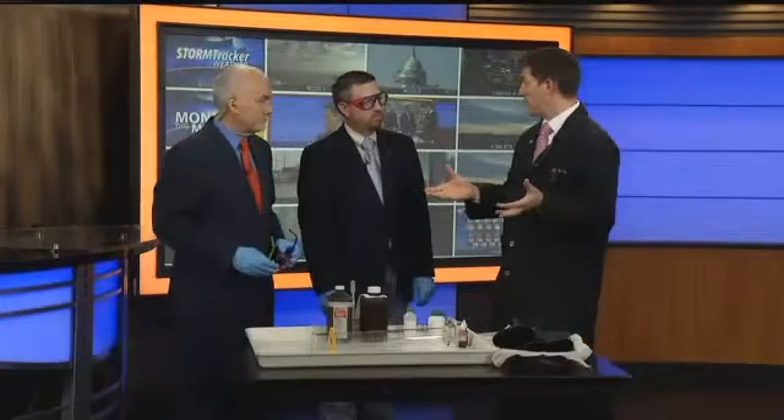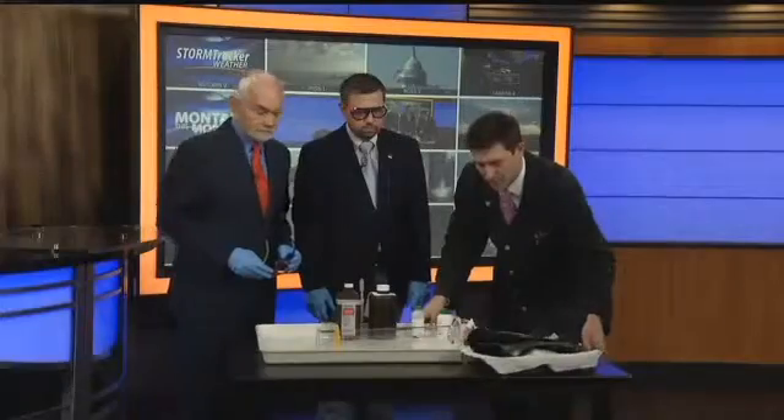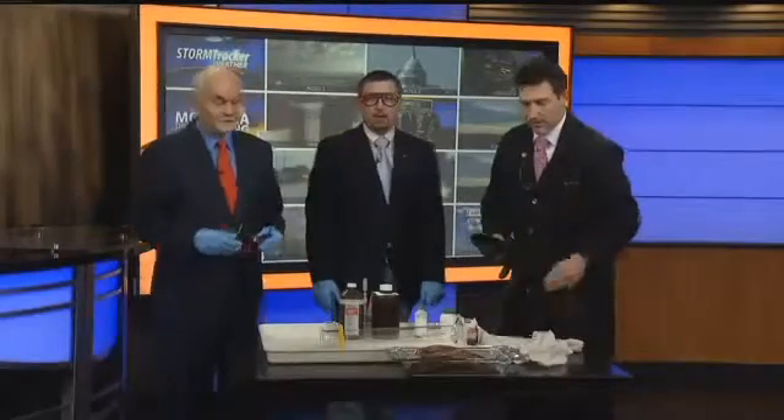Hydrogen peroxide is H2O2, which is very close to water, but with a little extra oxygen on there. Now, hydrogen peroxide is constantly changing into water — it's just very slow. When you put it on skin, it changes into water and oxygen. To model that, I've brought something special in. It's a good thing Russell's here, because we've got a nice big chunk of beef liver.